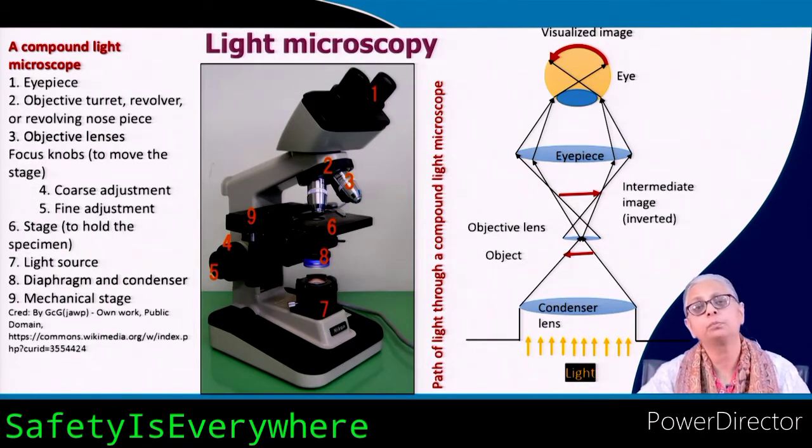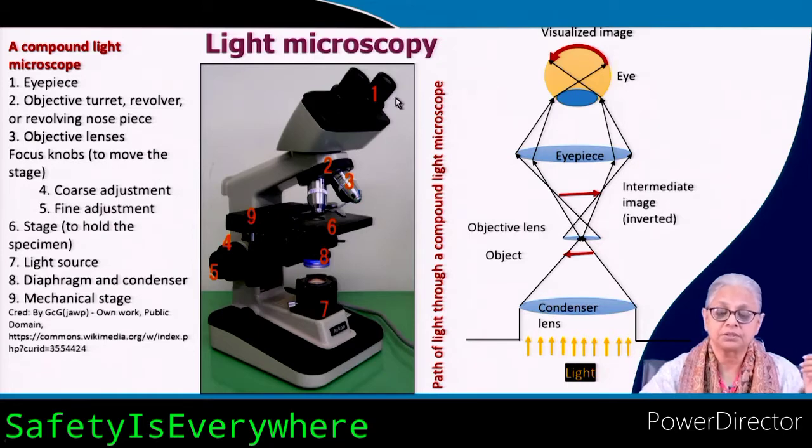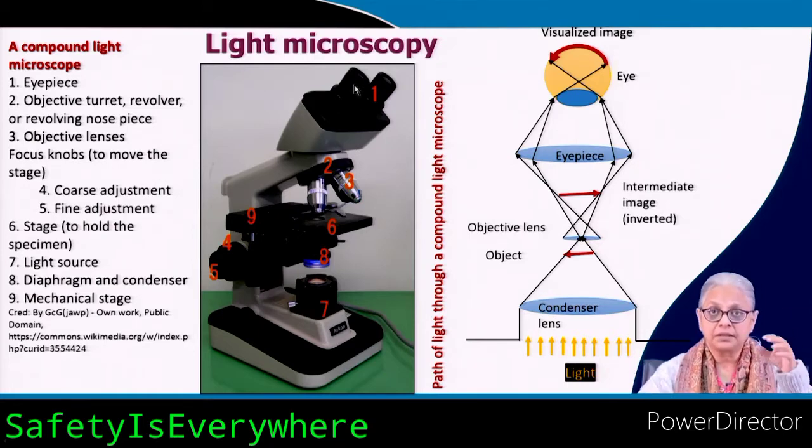And I'll add one more point over here. Another major advancement, I would say, especially from my time, more than 30 years ago, when I was working with microscopes, I found that it was very difficult to count bacteria under the microscope. So today we have the ability to put in a PC and a camera. Instead of your eyes, the camera is the eye.